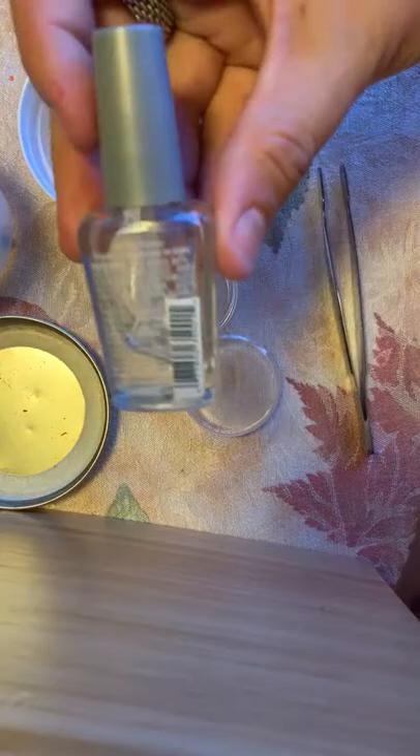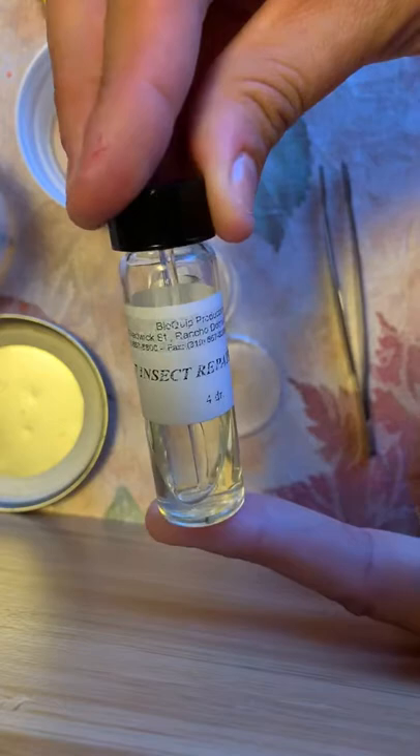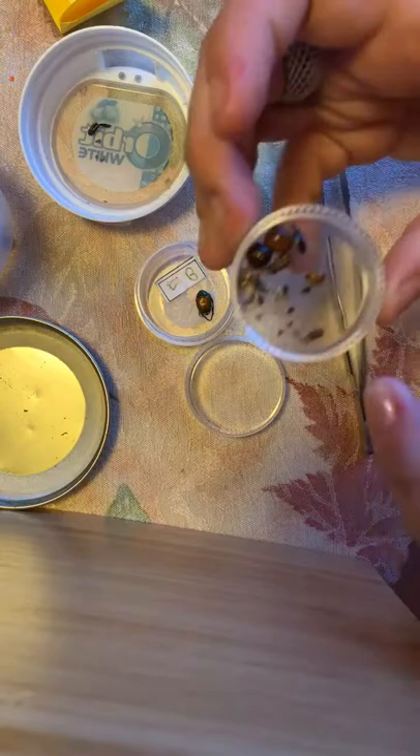We used insect glue, which is believe it or not plain old clear nail polish — any brand works. I also use this insect repair adhesive, which is basically clear nail polish as well. We just put a dot in the middle for the bug, they go ahead and place the bugs on, and a dot for the paper label.